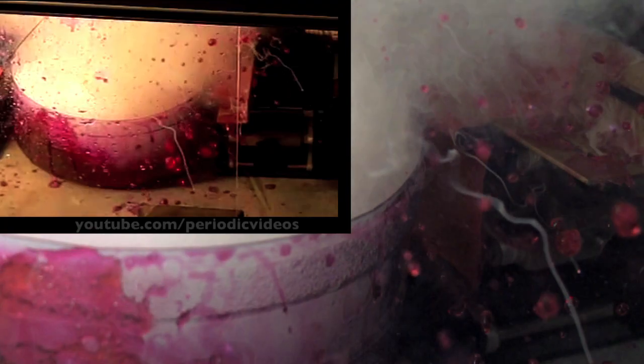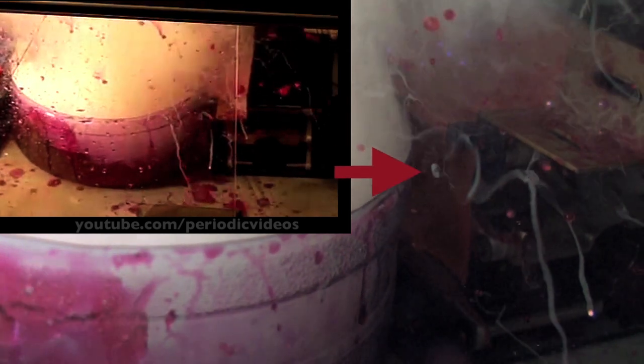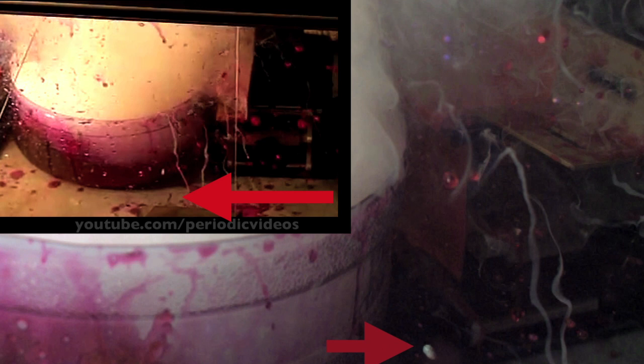And now the reaction continues. There is a small piece of rubidium metal that has jumped out. When the rubidium lands, it hits some water and itself explodes on the ground. I should have explained that in front of this there was a plastic shield, so you will see bits of water hitting the shield, rather like the water hitting the windshield of a car.